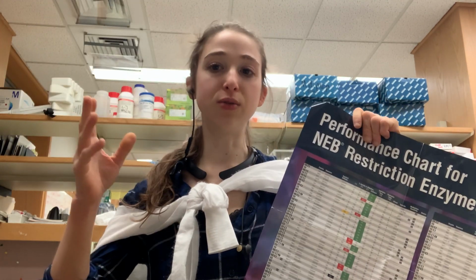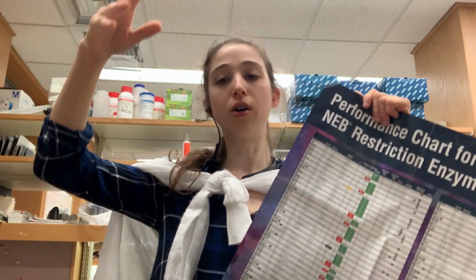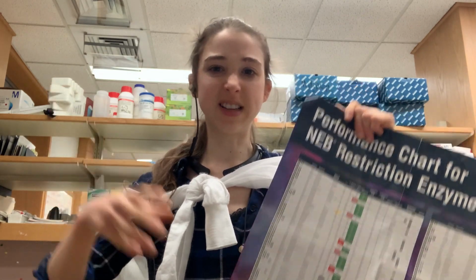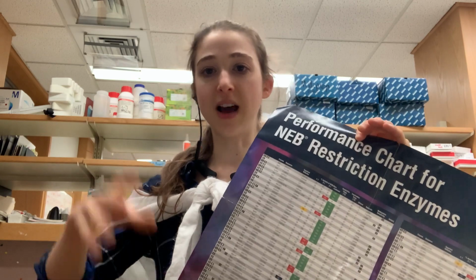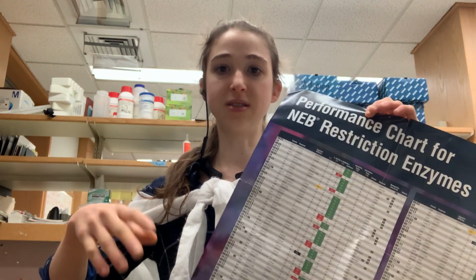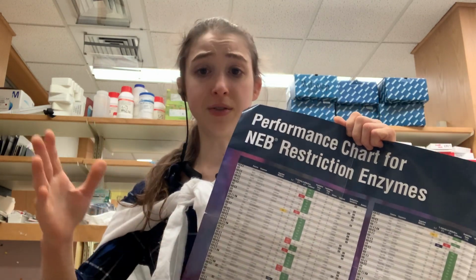We'll also get into some of the weird buffer names like NEBuffer 3.1, r3.1, CutSmart, all of these different buffers, and things like star activity, various things that have to do with how specific an enzyme is acting and how well it acts in different buffers, and how they're optimizing buffers. Basically, NEB, New England Biolabs, I do not work for them.